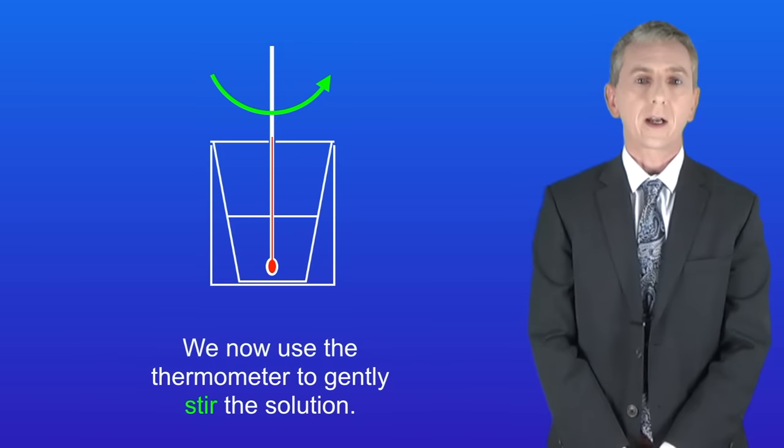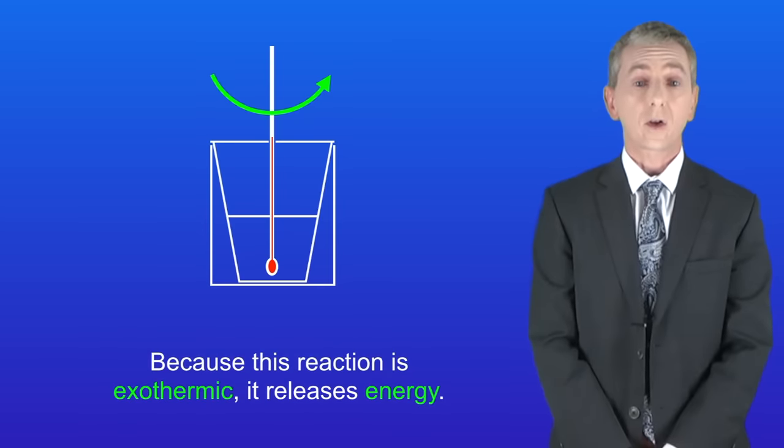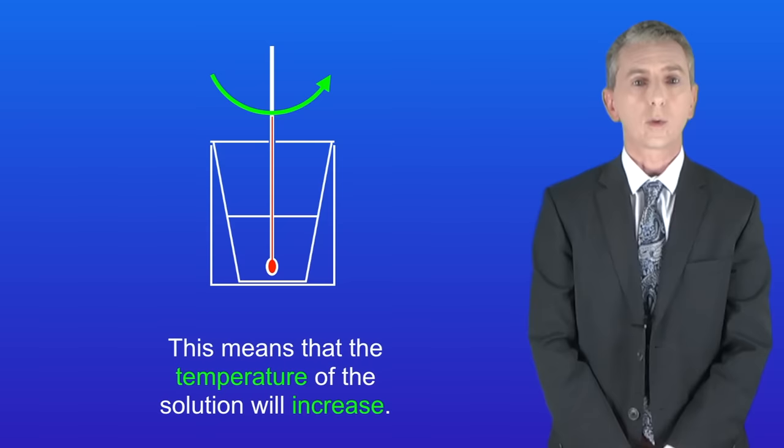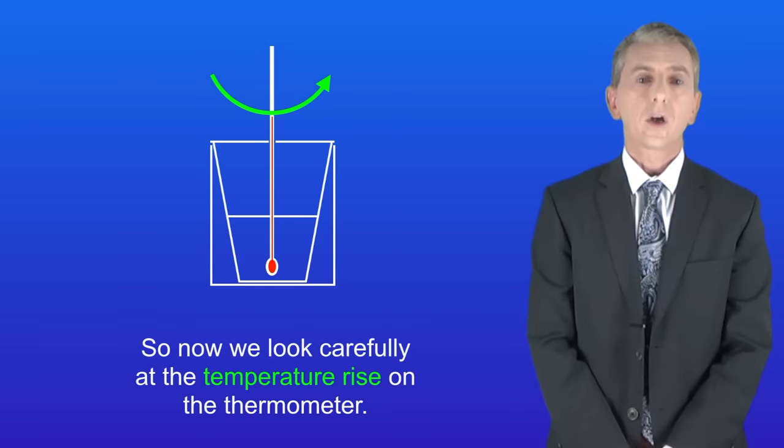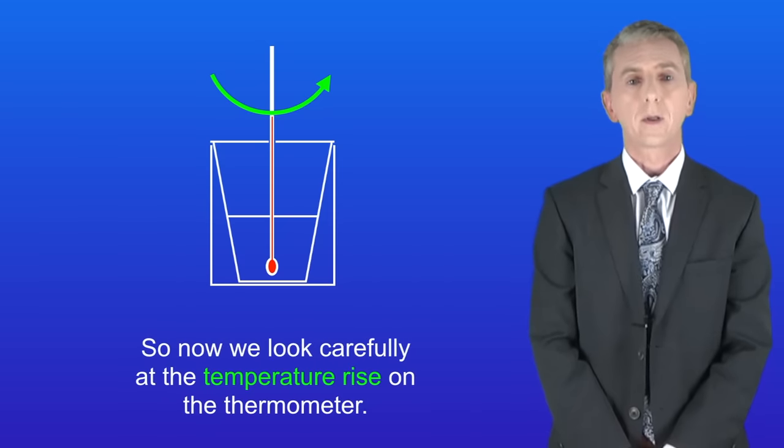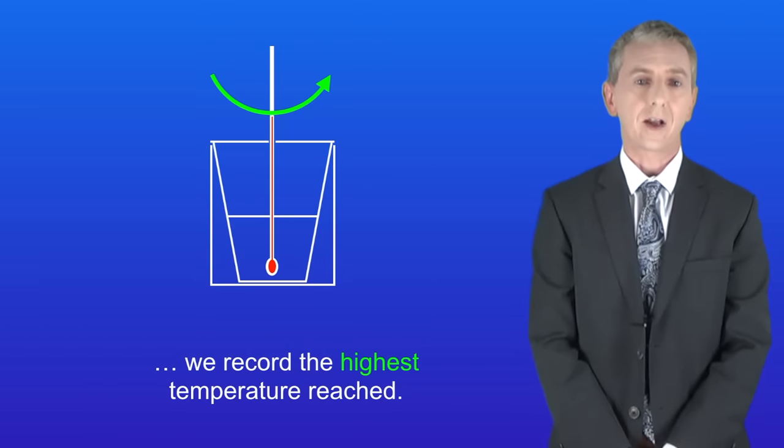We now use the thermometer to gently stir the solution. Now because this reaction is exothermic it releases energy and this means that the temperature of the solution will increase. So now we look carefully at the temperature rise on the thermometer. When the reading on the thermometer stops changing we record the highest temperature reached.